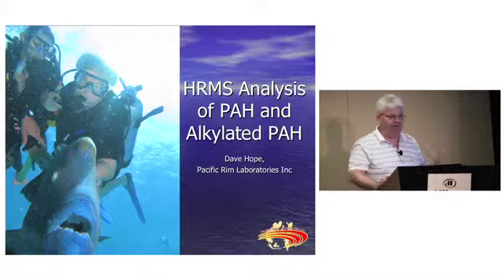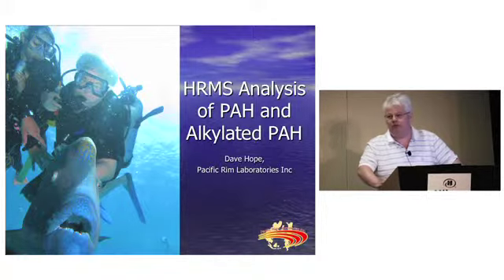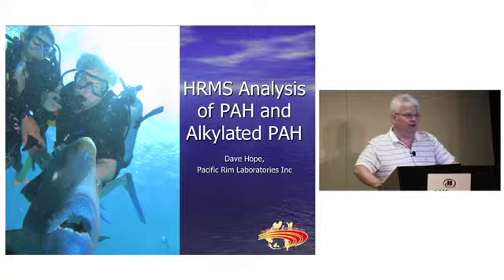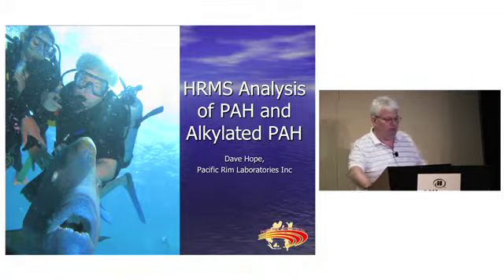PAH. Simple combinations of benzene, multiple aromatic rings. We've been analyzing in North America for about 30 years on a commercial basis. PAH are made up of multiple rings.